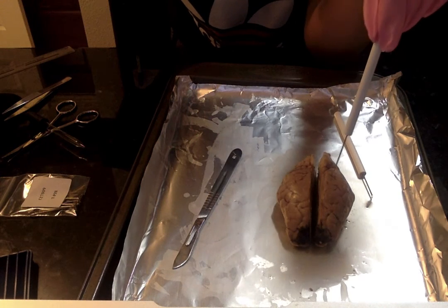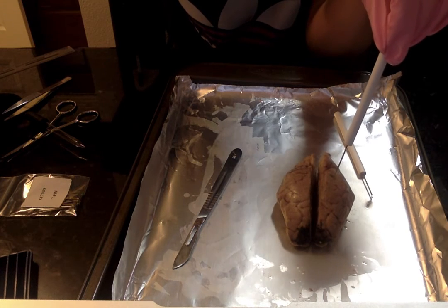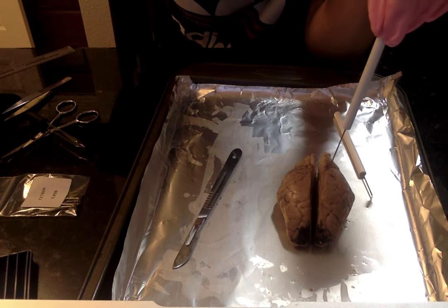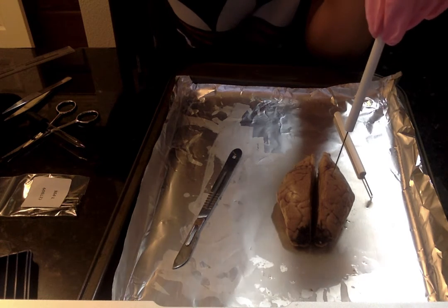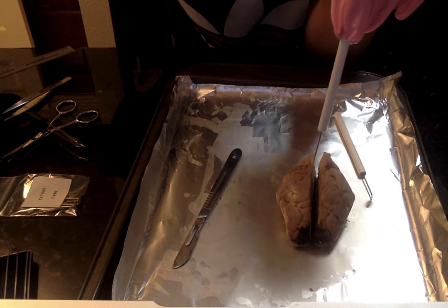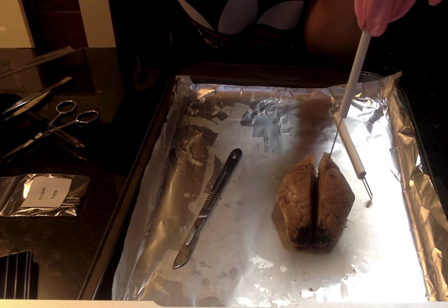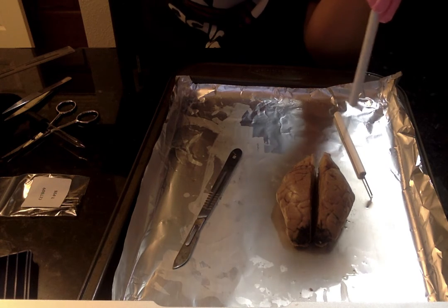If we look at the parietal lobes, these also have multiple different functions. It is the primary cortex for somatic sensation, the sense of touch and limb position, and it associates somatosensory, visual, and auditory activity for the analysis of space and the transmission of spatial information to the motor system. The occipital lobe is primarily responsible for the function of vision.